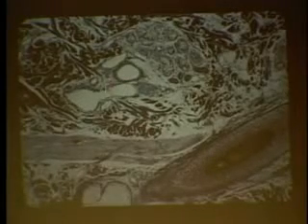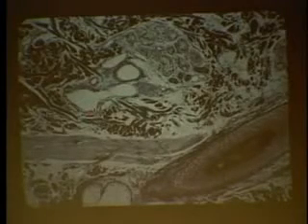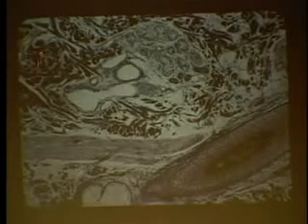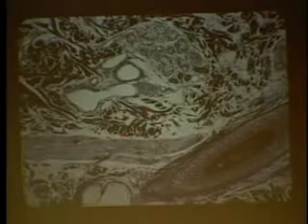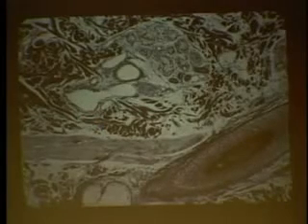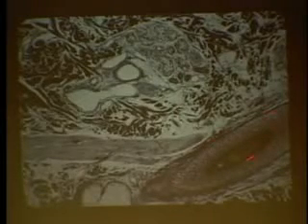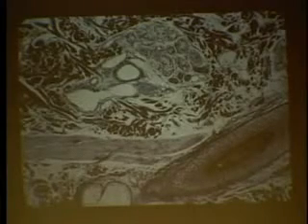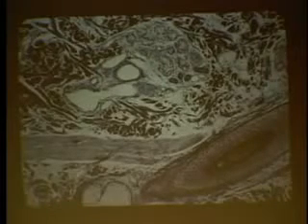What would be lining this vessel? Epithelium. So that's your second tissue, right? And then what are all of these fibers here? What kind of tissue? Connective, I just told you. So what one's missing? Nervous tissue, right? This happens to be the skin. This is the hair follicle. This is the muscle. When you get cold, your hair stands up on end. That's the little muscle that allows it. So you can see 3 of the 4 tissues. Next slide.